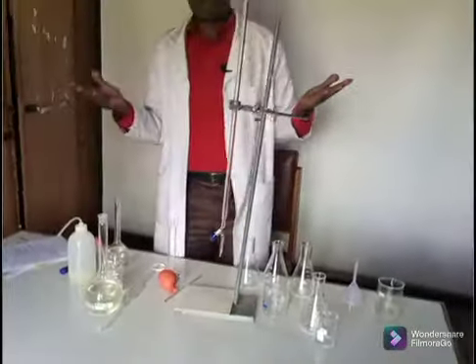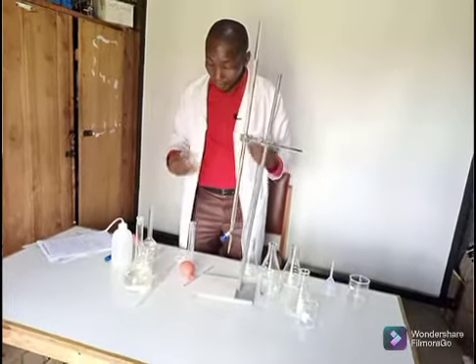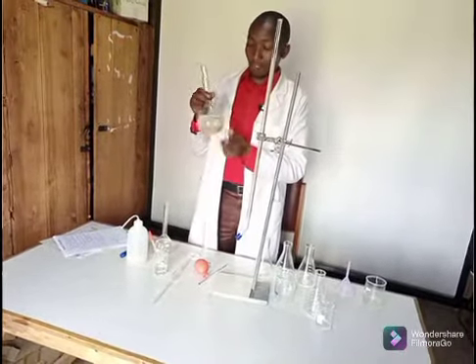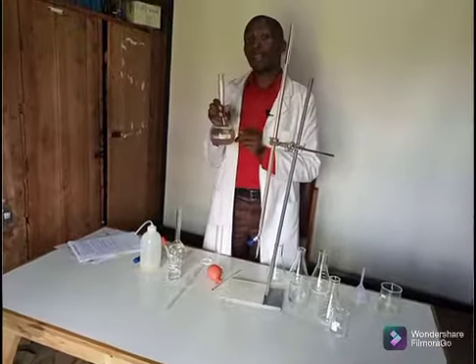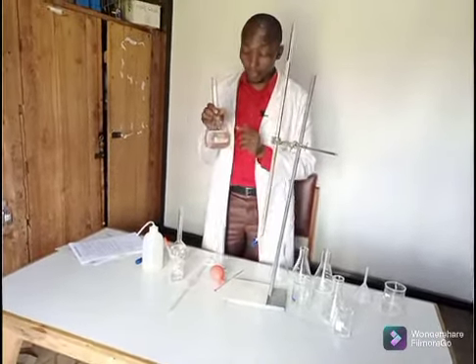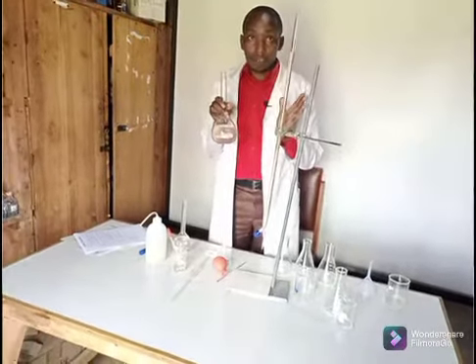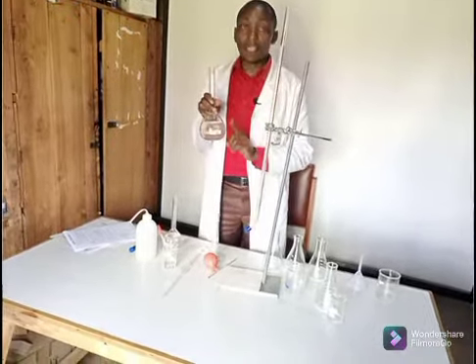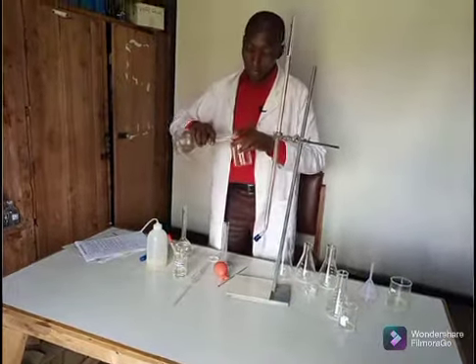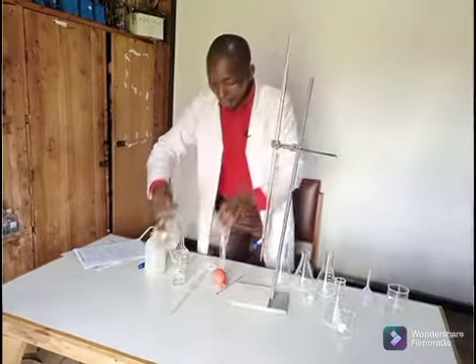So what is the next step? The next step will be to pipette. Now, I have solution Q. Remember, I know how solution Q is made, so this will be my standard. This is the standard solution because I know the concentration. Whether they've given me the molarity or not, I can calculate it. I can place a little here.